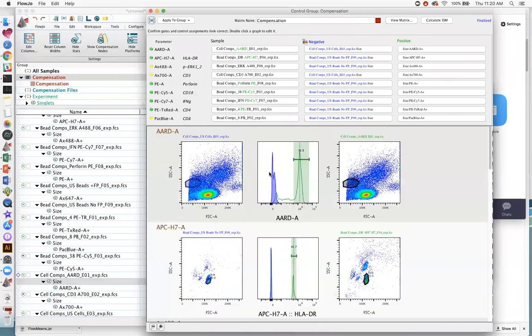You see how the negative here too has this kind of double spike, right? The autofluorescence here is a little bit higher for dead and dying cells. These are unstained cells, so there's no AARD in the medium, but you can see how their autofluorescence is increased. And we just want to make sure that the autofluorescences of these guys are pretty decently matched between the negative and the positive. All right, so from here we'll go on.